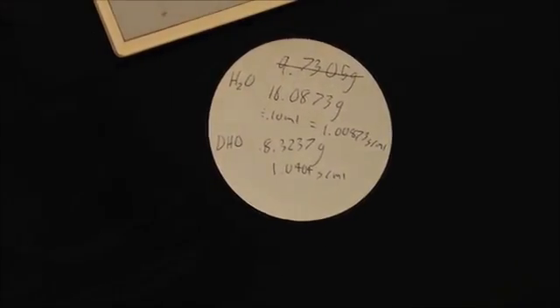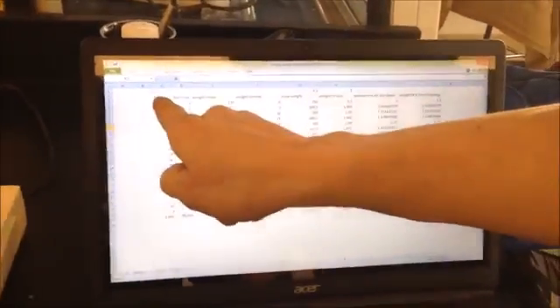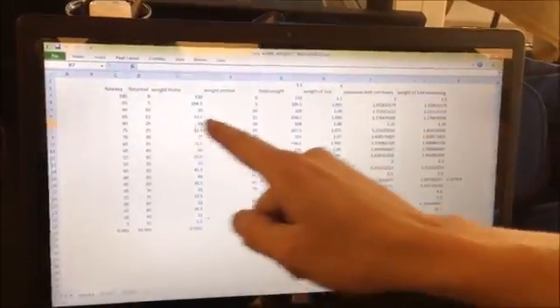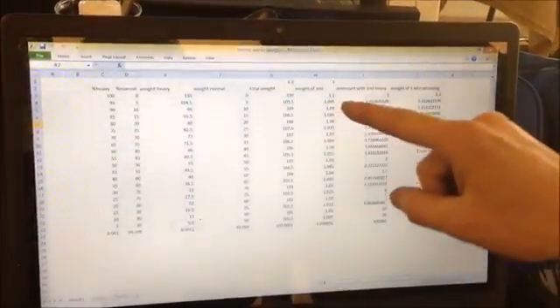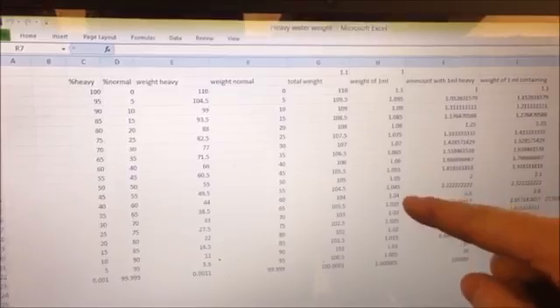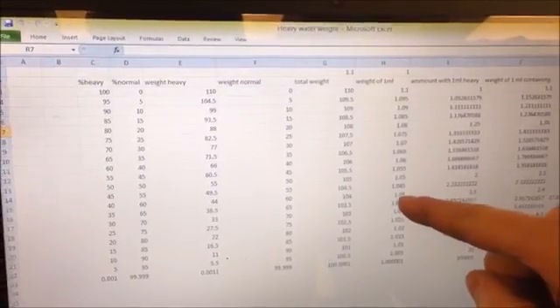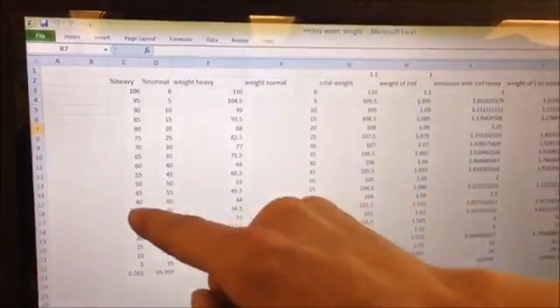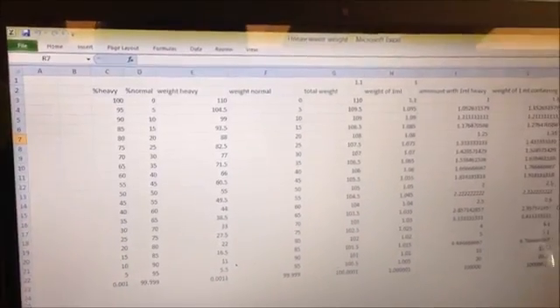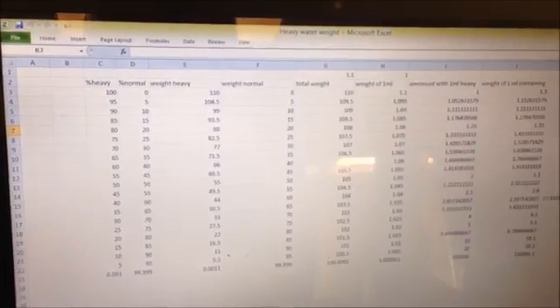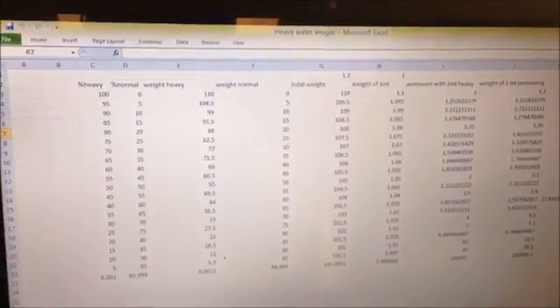That's it. From that we might be able to figure out how much deuterium we have in there. I have a spreadsheet on my computer. Okay, so I've got the percentage of the heavy isotope in here and the weight if it was pure heavy. We go over here to the weight of one milliliter at this percentage, and the weight of our one milliliter was one point zero four. This one right here. Does that really mean I got forty percent heavy? I think so. Remarkable. Well done, Mr. Cody.